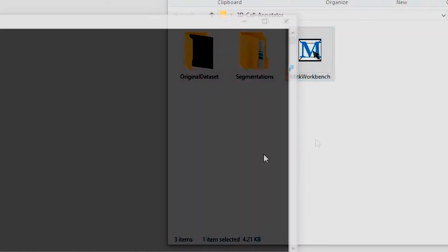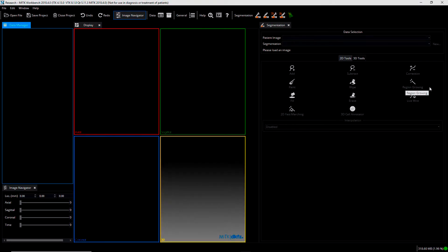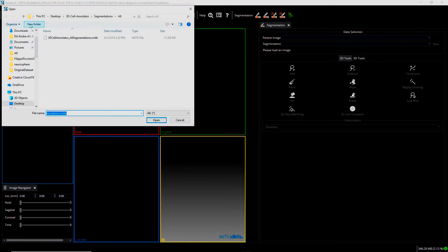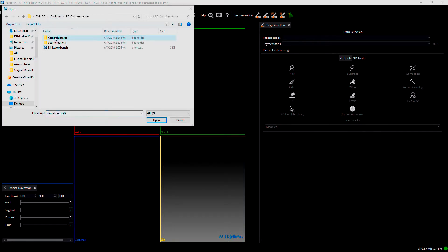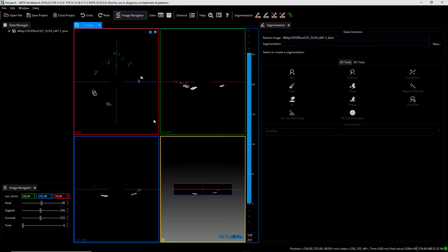In this video, to show you how to segment cells with our tool, we will use a sample dataset composed of 56 cells, namely a mouse embryo dataset with stained nuclei. The dataset was acquired with a confocal microscope and you can find the link to download it at www.3d-cell-annotator.org.